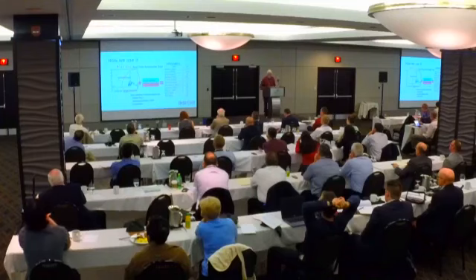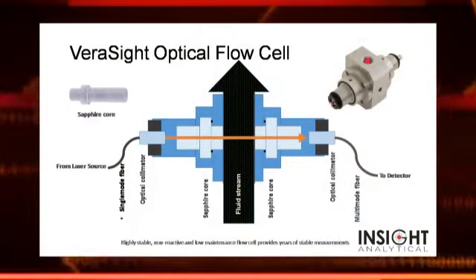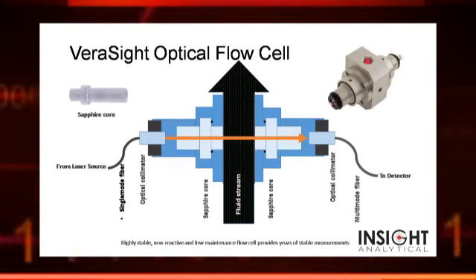So that's one piece of this puzzle. I can take a measurement, get this chemical data, and get it in real time. But the other big thing we want to concern ourselves with is, can I do it reliably and robustly? One of the things we've been doing is taking that measurement directly out to the process. Rather than bring the sample back to an analyzer building, we put a probe out at the process. We end up with a configuration that looks kind of like this.